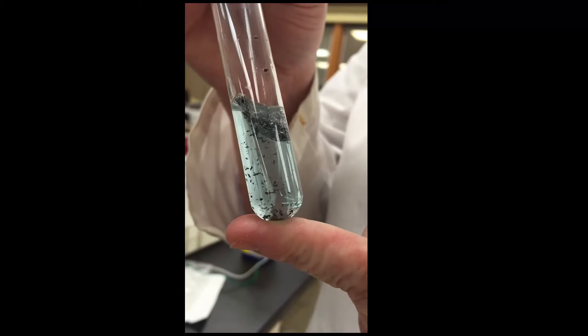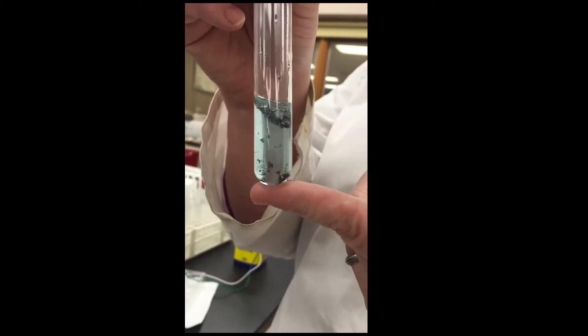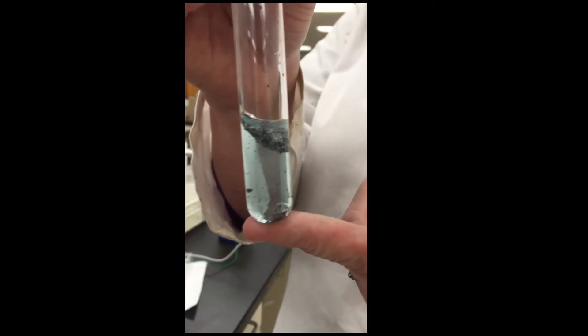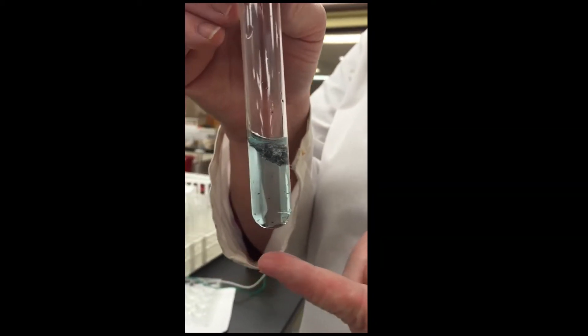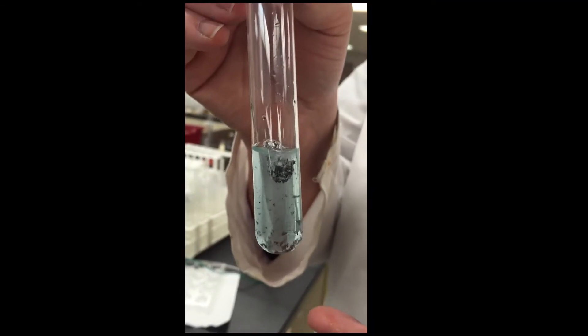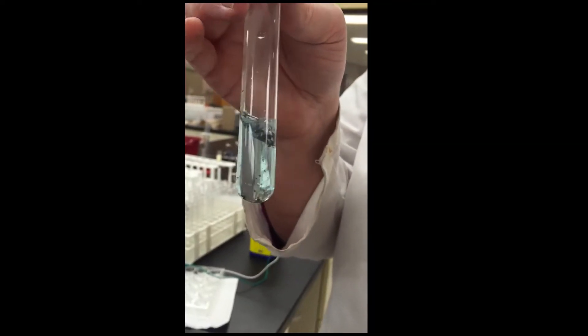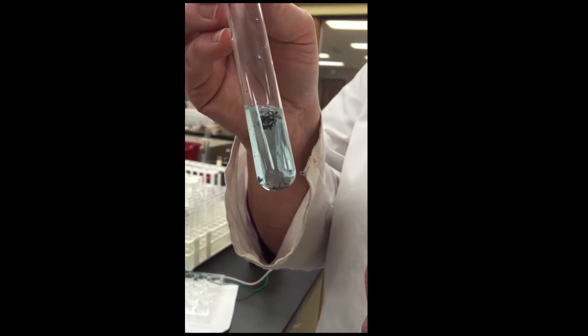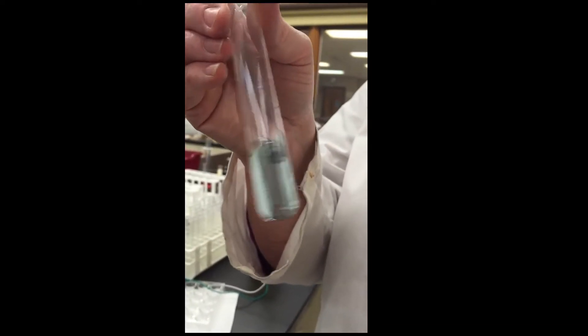As this reaction takes place, the blue color starts to fade because it is the copper ions that are making the solution blue. As those copper ions get their electrons back and become copper metal, they're no longer dissolved in the solution. They are becoming less concentrated, and it is getting less and less blue.